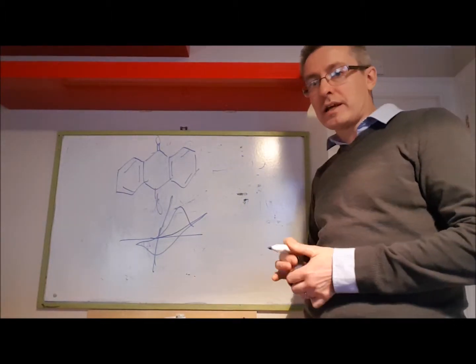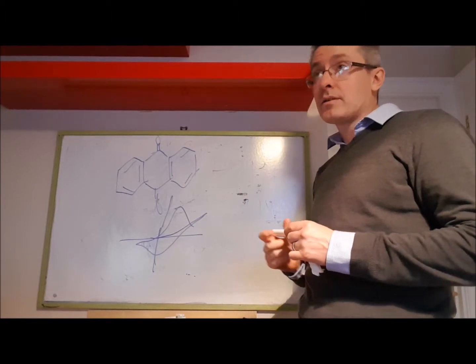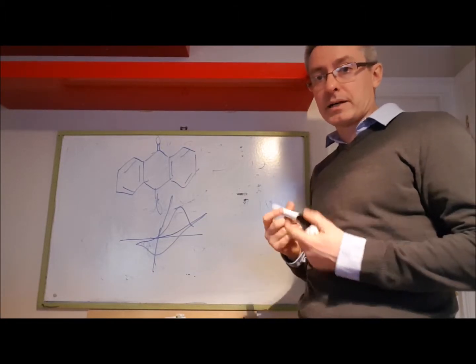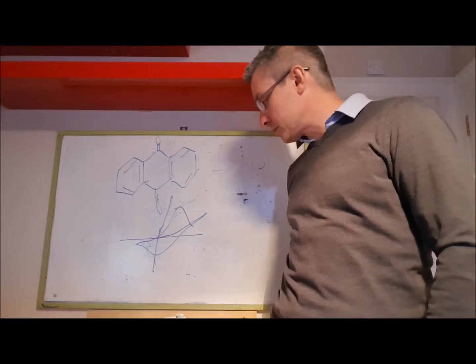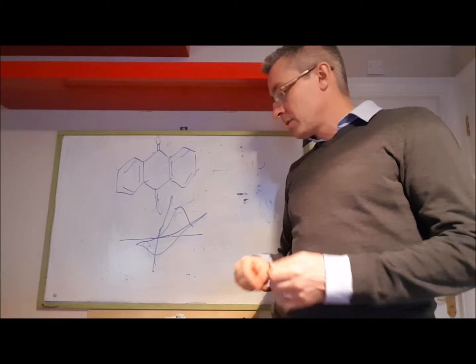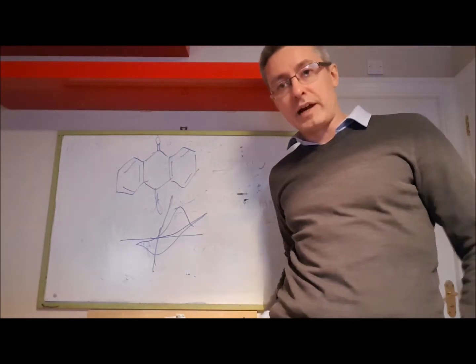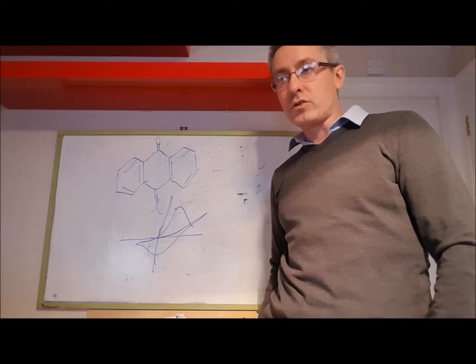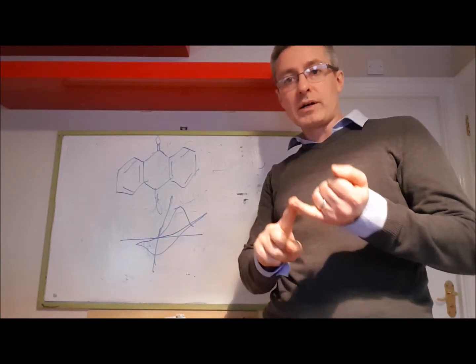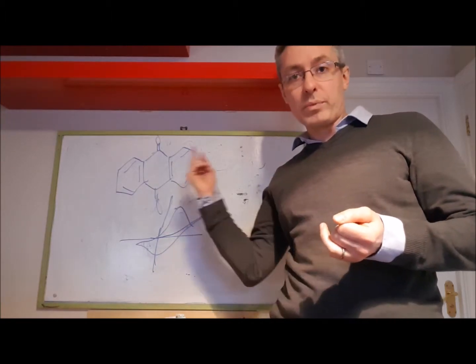Basically, I put lots of ifs and buts and things that could go wrong. My suggestion is to go for it. I would suggest what I'm going to do: a second part of this video, where I go through all the different types of electrodes from Zimmer and Peacock, and talk about the strengths and cons depending on whether you're trying to measure conductivity, redox active molecules in the oil, or pH.